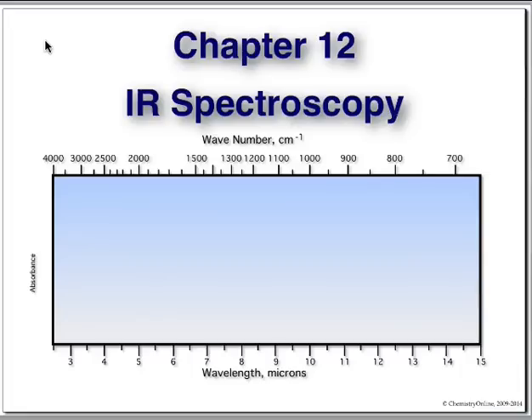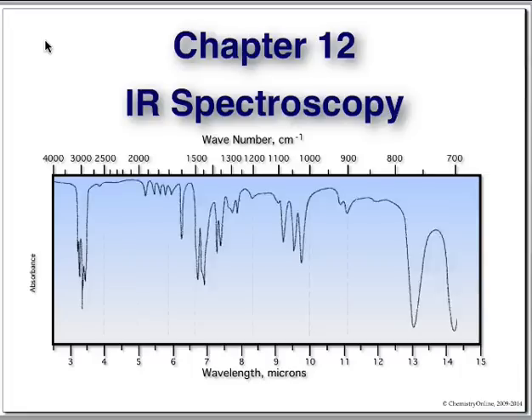All right, infrared spectroscopy. This little wiggly line that's being generated here is an infrared spectrum. That machine over there is a little Fourier transform IR. We used it a little bit in the lab in organic one. One of the reasons we're having trouble with the labs for organic two is that they're not really using spectroscopy very much. And we should, because at this point, you should be able to do this. So we're trying to modify the labs as we can to do more things.